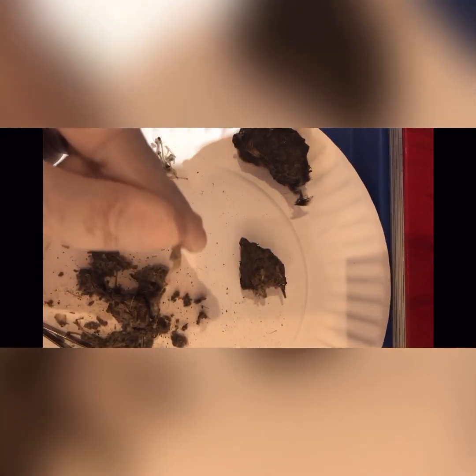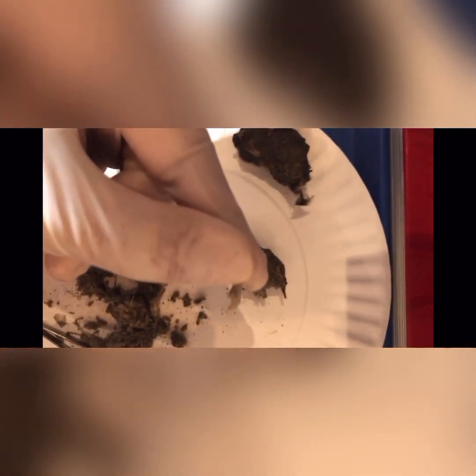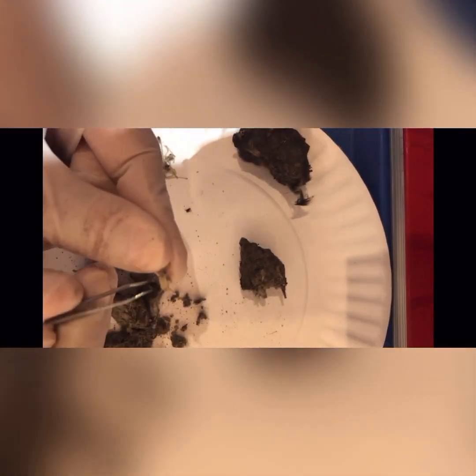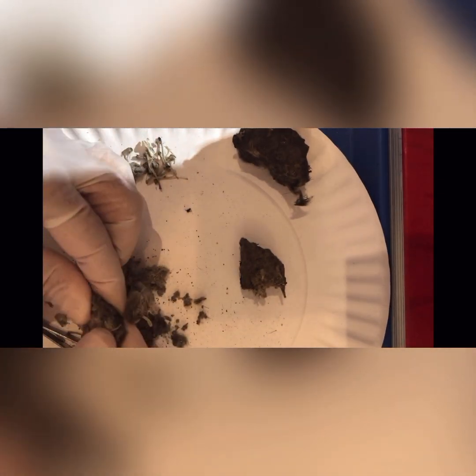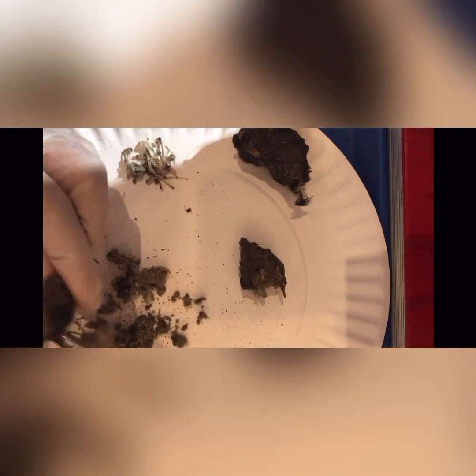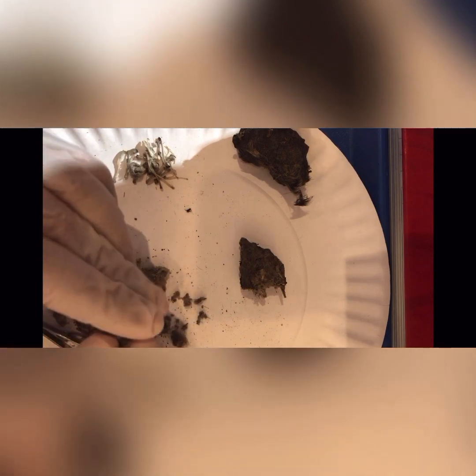Can you guys see that? Bring it up closer. This is a jaw. Flip it around and you can see some tiny, tiny little teeth attached to the jaw. Beautiful. We're gonna keep collecting all the bones, putting them all to the side.